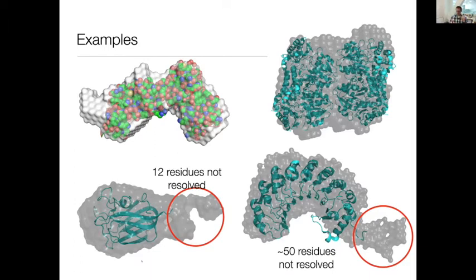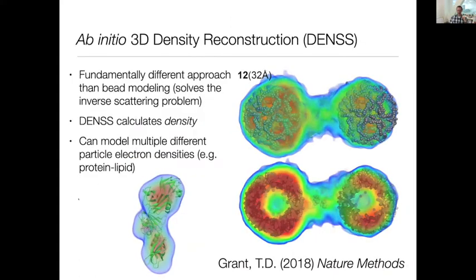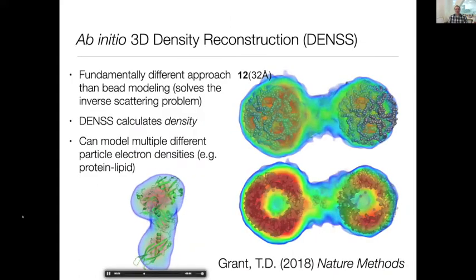All right, so that's a brief overview of how bead modeling works. And now I'm probably going to spend a little bit more time on DENSS, since this is what I do. I know far more about DENSS, and so I can give you some more details on it.